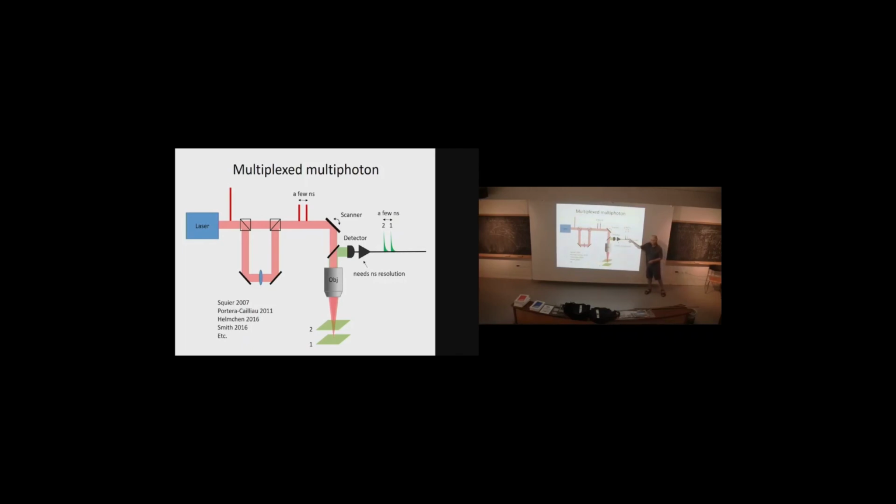And so these two fluorescence signals come from different depths. They are separate enough that I can distinguish them with my electronics. The electronics are fast enough, and they're separated enough that the exponential decay of my fluorescence is not a problem. There's not too much bleeding from one pulse to the next, so I can distinguish them.